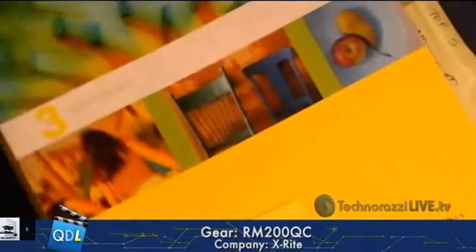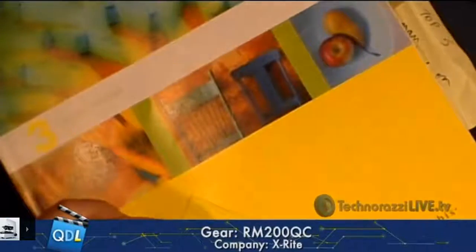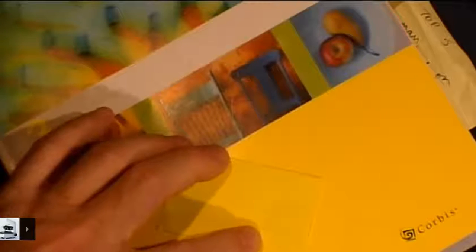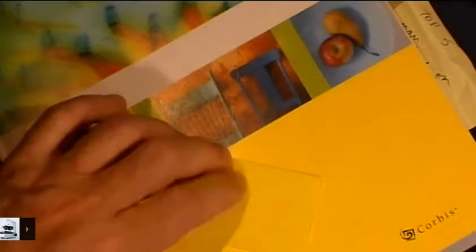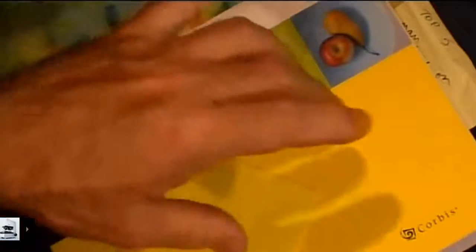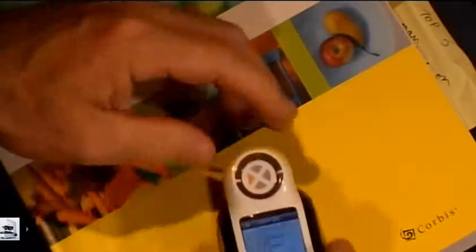But let's compare to a different yellow. I happen to have a very close yellow. In fact, let me show you. I happen to have a book here. On your screen, these yellows probably appear to be fairly close, and they are in fact fairly close. My standard is a bit lighter yellow than the color on this book, but we'll just measure the one in this book just the same.